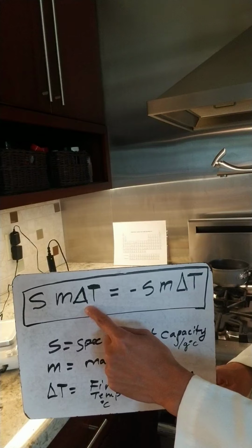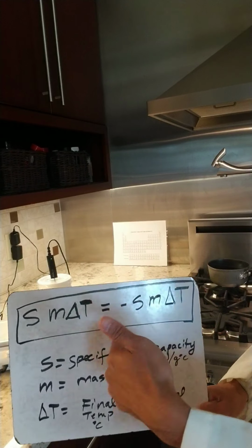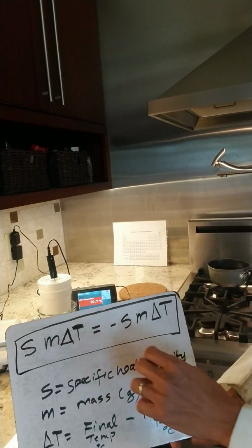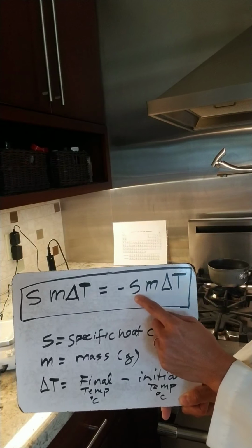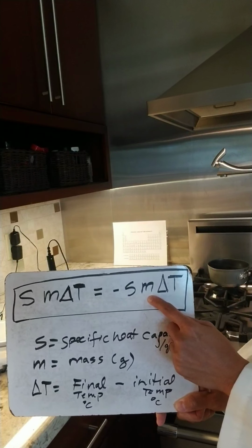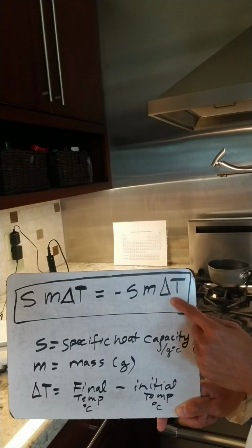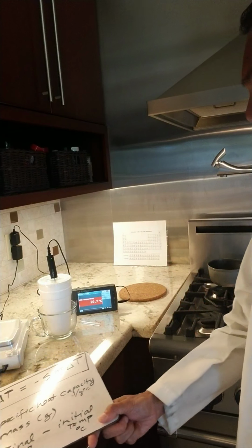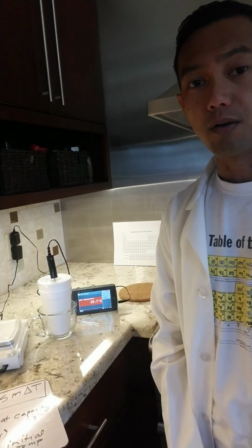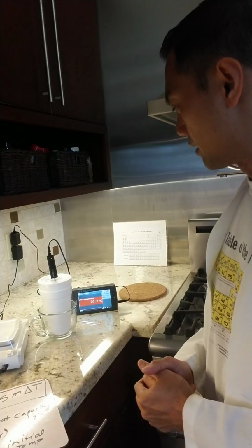Our initial temperature here was the number I had pointed out earlier. I can't remember what it is now, so I hope you were keeping track when you were watching. Final is whatever we call the final temperature. This is the missing number that we're trying to identify. The mass of this metal, we're going to test pretty soon. And then the initial temperature was 100. The final is whatever, again, we call. This is the third time I believe that we're measuring, and it's still 20.7. I'm going to give it one more measurement, and if that's the case, then we've collected our final temperature.